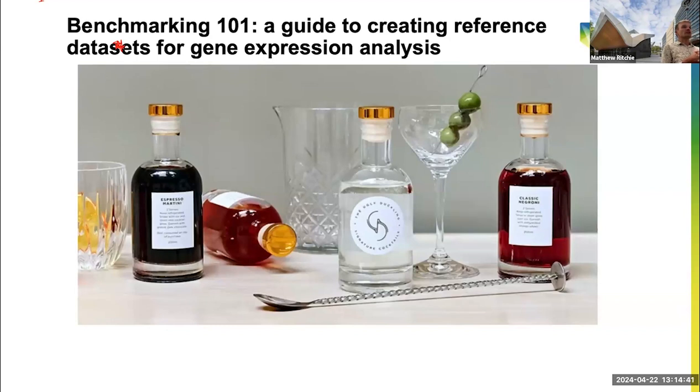So I wanted to give you a sense of how we make these benchmarking data sets. For microarray, bulk RNA-seq, and single cell, people from time to time design these bespoke experiments which have inbuilt ground truth, and there are particular ways that people create these reference samples in the lab to have some idea of which things are going up, which things are going down, or which things are not changing.